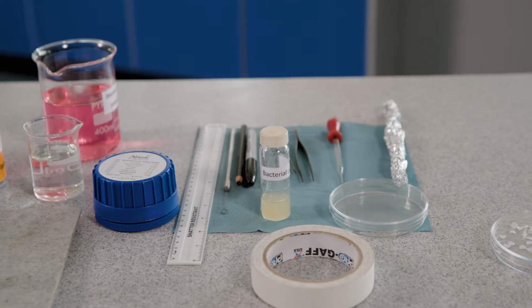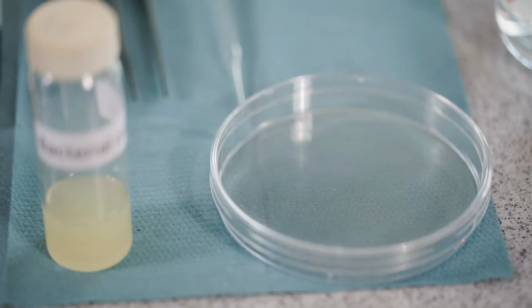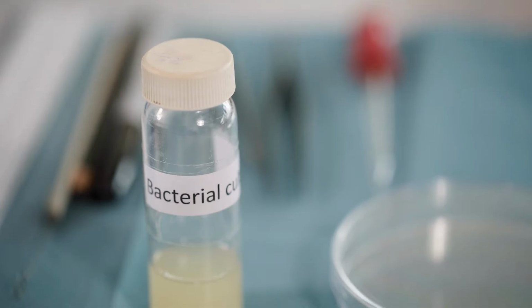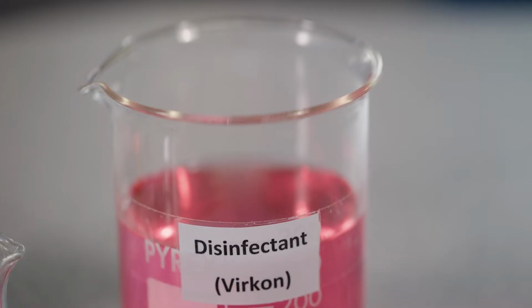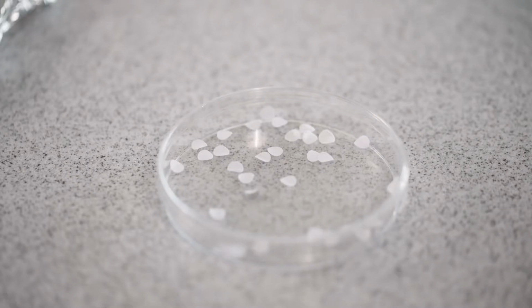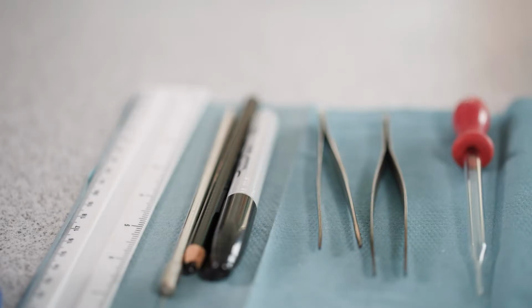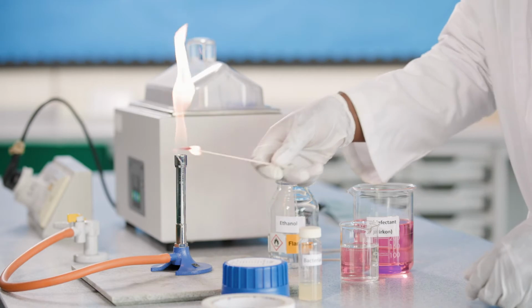your experiment. To carry out this experiment, you will need the following equipment: Petri dish with lid, screw top bottle of sterile liquid nutrient agar, keep in water bath until needed, bacteria culture in screw top bottle, sterile pipette, sterile spreader in wrapper, beaker of disinfectant, 2 small filter paper discs of different antibiotic concentration, small disc of sterile filter paper, sticky tape, marker pen, forceps, ruler, ethanol, Bunsen burner, and heat-resistant mat.